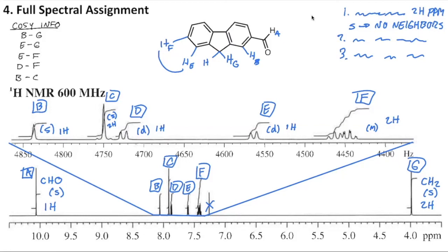So because of that, I have to think the other proton here adjacent as well must also be F. Well, it's not exactly the same as F, so let's call that F prime. Since we don't really know which one is which here in this kind of lumpy peak situation, we'll call this both F and F prime because they're not exactly the same, but they're very, very similar to one another.